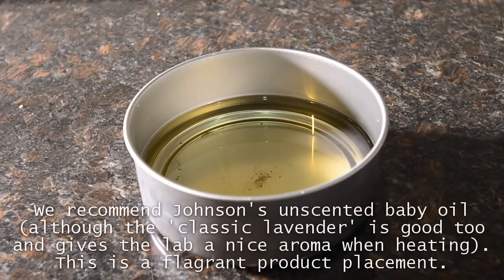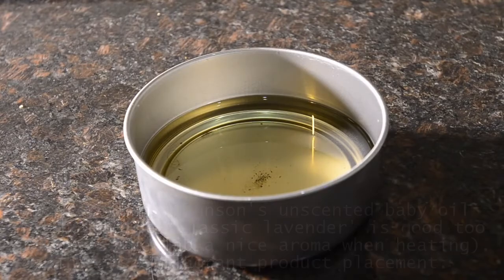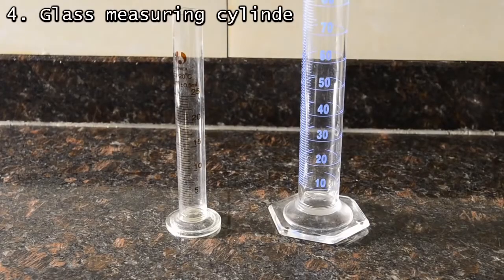Sometimes you want a strong but steady temperature, so for this we recommend the DIY oil bath. We use a metal pot filled with unscented baby oil, which works well. Okay, now onto the sexy stuff — glassware.